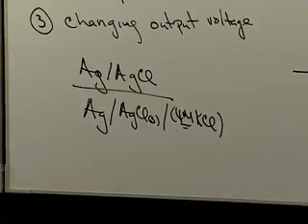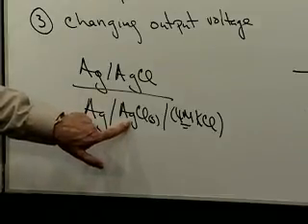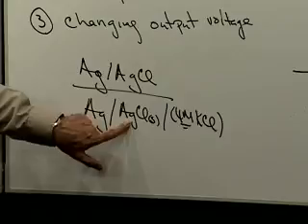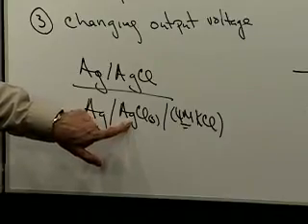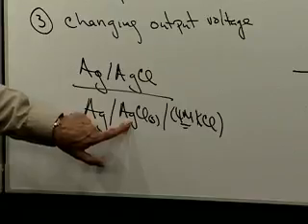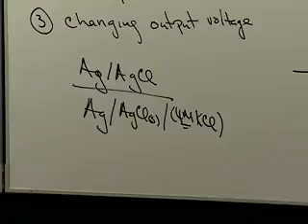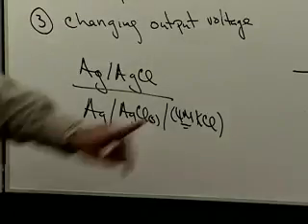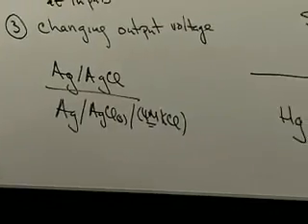Of course, there is another problem here, but it's pretty easy to solve, and that is that the silver chloride is somewhat light sensitive, and so the assumption is you always have silver chloride there, and therefore the right number of silver ions, whatever it's soluble at in water. And if you leave this thing lying under the fluorescent lights in your lab, you can convert all the silver chloride over to silver metal and wipe out that part of the redox couple, and it won't work anymore. So from that point of view, the SCE, if you're not worried about temperature stability, is the way to go.